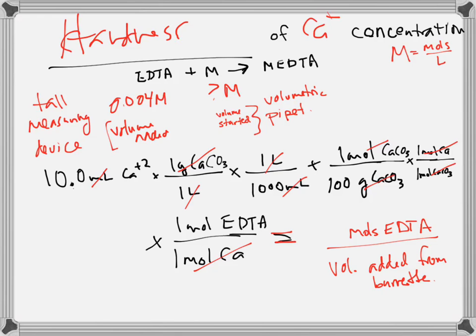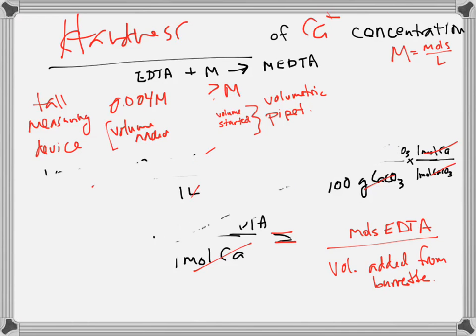Our answer would be wrong, so what do we do? Do it again. What if that one's wrong? Do it again. We'll try and average out all those results. So what you're going to end up doing is doing the sequence of titrations now at least 6 times. Okay? The rest of the calculations are ultimately just unit conversions. So when we go through and we did this calculation, except now for our calcium, what we would end up with at the end would be a concentration in moles of calcium per liter.